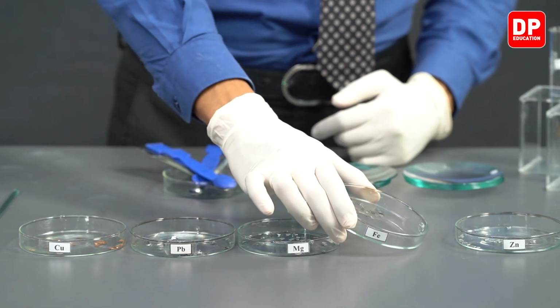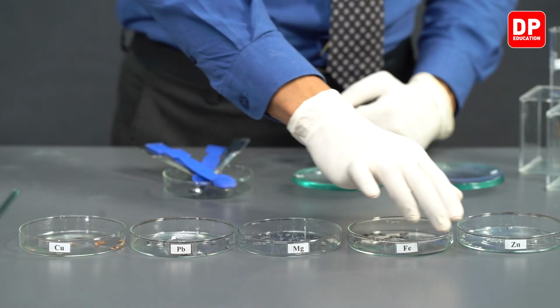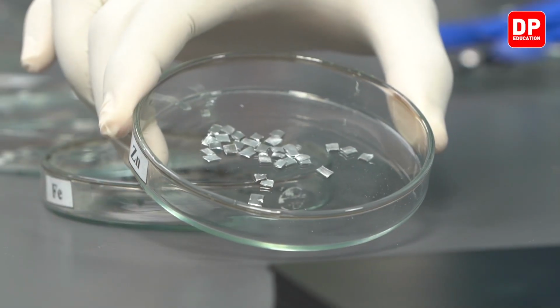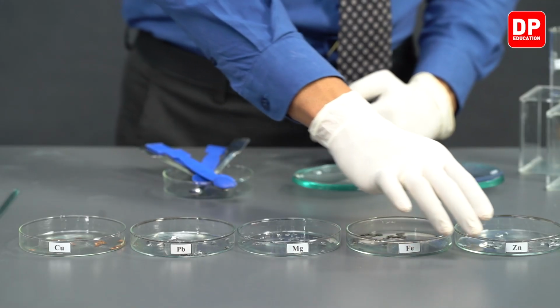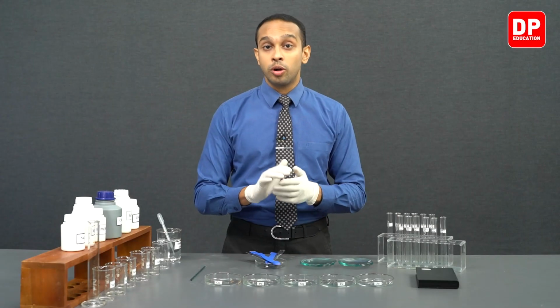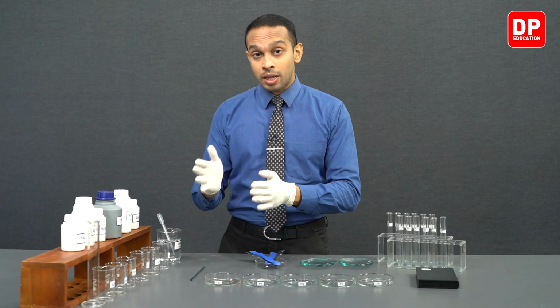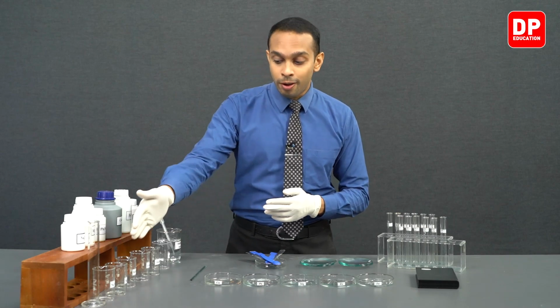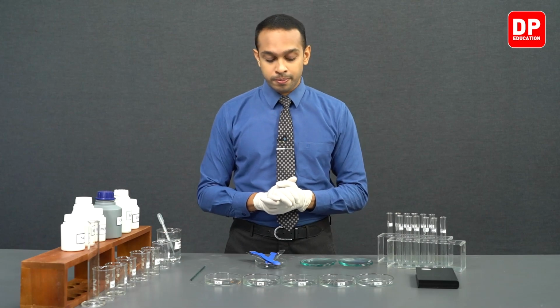Small cut pieces of iron are here. And then finally we have zinc. So we will be using these metals in this experiment, and we are going to observe how these metals are going to displace some of the metal ions found in the solutions we prepare in the beginning of this experiment.